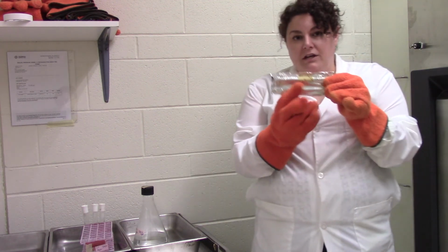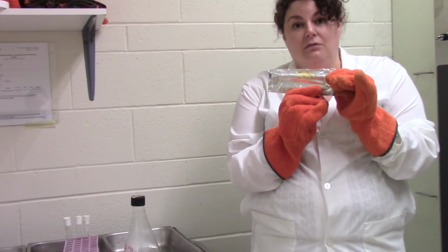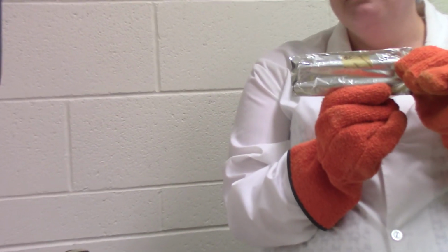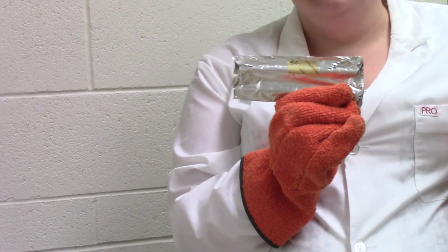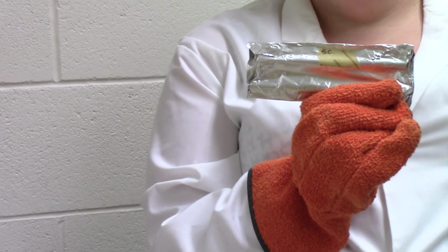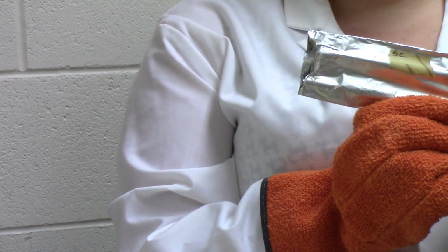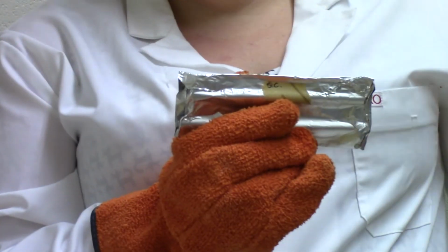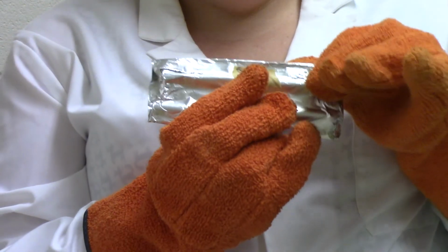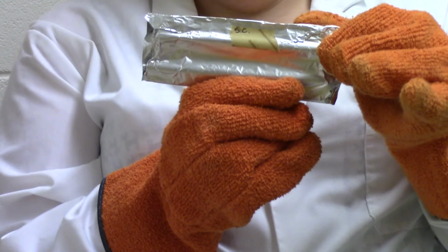But here you can see my indicator tape has changed color. That's showing me that my autoclave got up to temperature. And our technician Melinda does weekly tests to actually test and make sure that the autoclave is staying at the high pressure steam for long enough and actually sterilizing everything. So between those tests that Melinda does and this tape telling me that the autoclave got hot enough, I am quite confident that my items were sterilized.